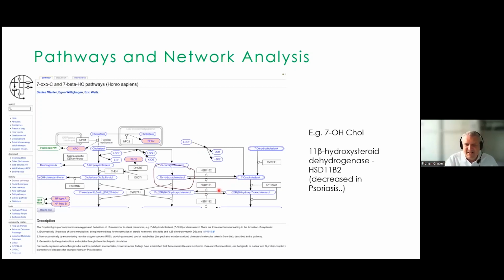7-hydroxycholesterol is dysregulated in psoriasis. And so I fed that in. Taking this example, it was elevated in the plasma of psoriasis patients, and you can then put this molecule into the context of the signaling pathways that are described and deposited here.